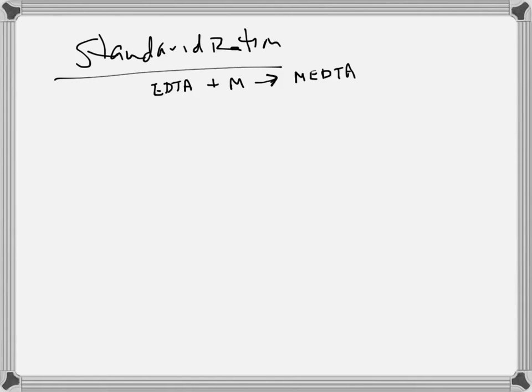Does it tell you what the concentration of calcium ion is in our standard? Yes. I know it's on our bottles. I don't know if it's in your procedure. Someone have it? So we know the concentration of our metal ion, 1 gram per liter. And that's of our metal. We'll go ahead and say calcium ion. Our balanced equation tells us the mole-mole ratio.